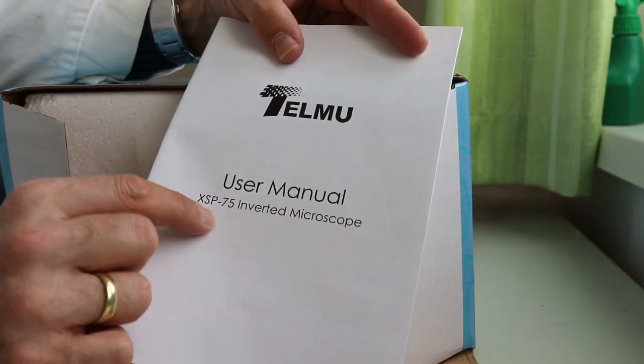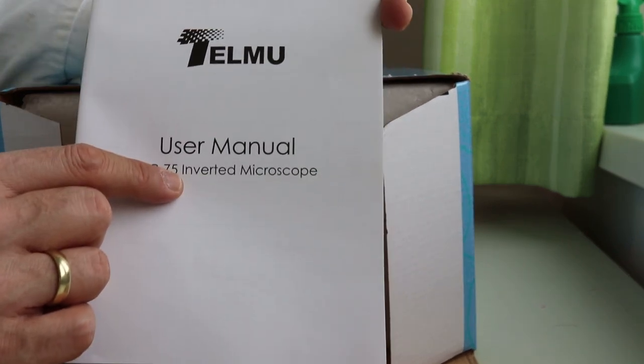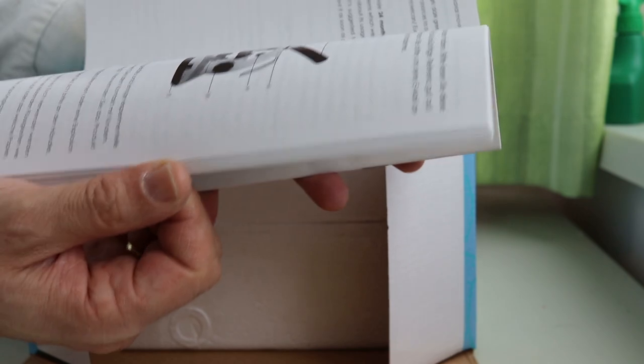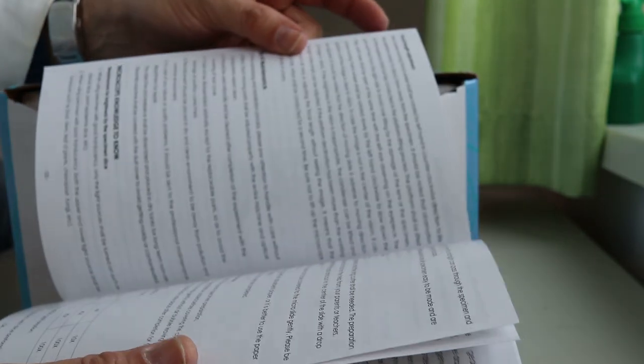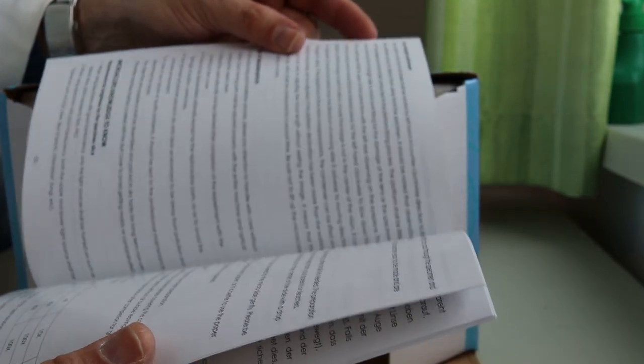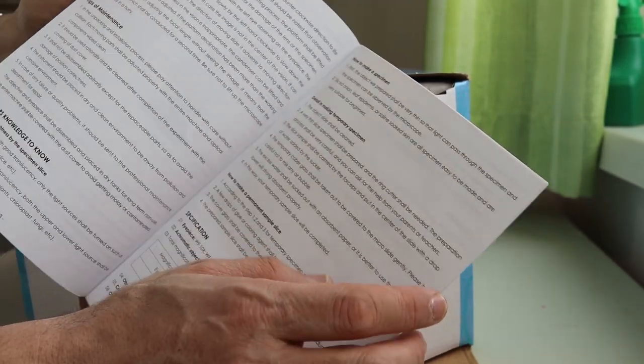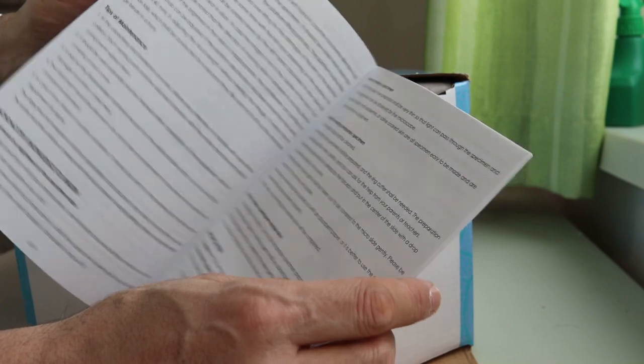But it's really funny, it says here that it's an inverted microscope. It's not an inverted microscope, it's an upright microscope. So I would say you've got to take this user manual with a grain of salt. Otherwise, the basic information is there. At least I get the feeling that they attempted to put together a reasonably meaningful user manual, but they didn't always succeed, I have to admit. There's even a short description on how to make a temporary specimen, but I think this is a little bit too short.